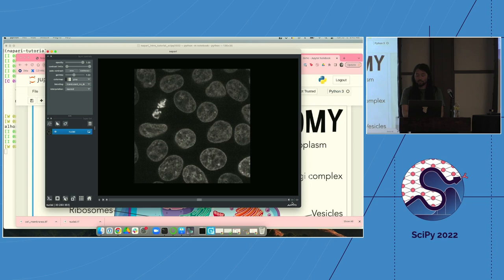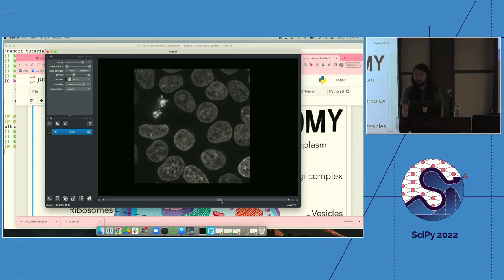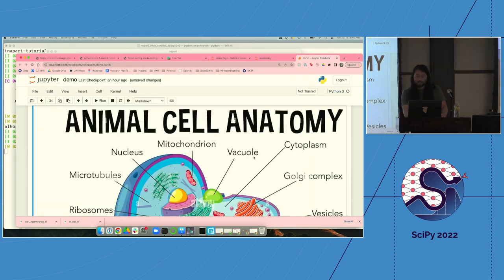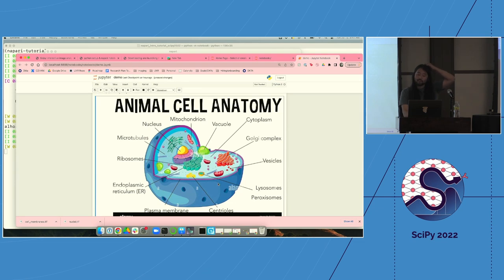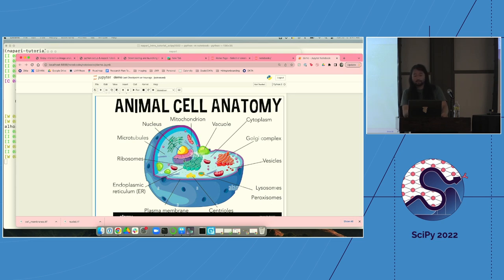If you aren't doing bio-image analysis regularly, you might wonder what these blobs are. This is a cartoon of a cell — the nuclei are the purplish region where the DNA is stored. All of your cells have a copy of your genome, and that's where it lives. The next image we'll look at will be the cell membrane — the outside of the cell — which gives us the extent or shape of the cell.